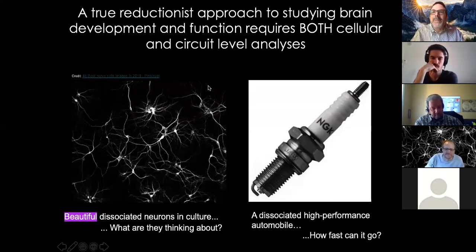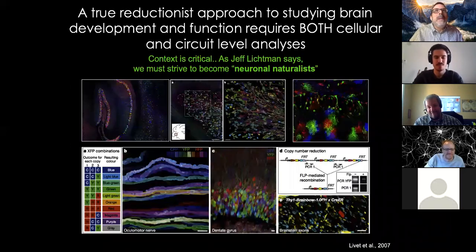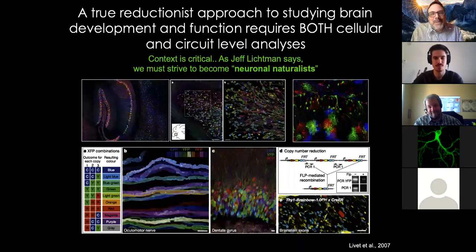The in vivo system. And so it's kind of like asking, here's this spark plug, and this is a dissociated high performance automobile. How fast can this go? So we really want to get back into the sports car. And so approaches to get us there have obviously involved the ability to pull out, within the intact brain or within original tissue, the individual cells, and pull them out optically.